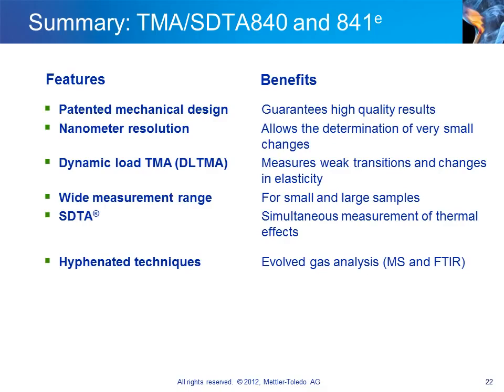TMA is also a very sensitive method and can be used to determine weak physical transitions that are associated with changes in modulus, curing, and delamination.